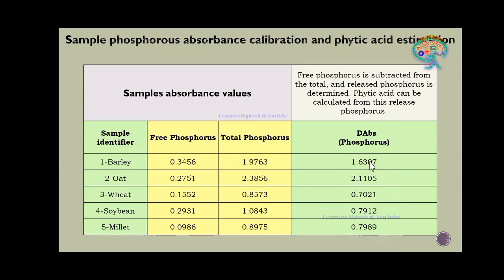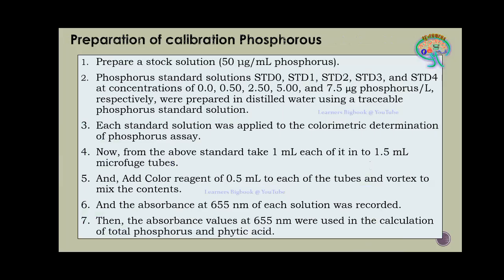Before that, we are going to discuss one more required slide, that is preparation of the standard phosphorus calibration, where the standard phosphorus will be taken as the reference for the further calculation of the sample phosphorus and further calculating the phytic acid.